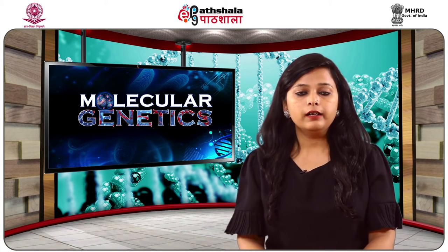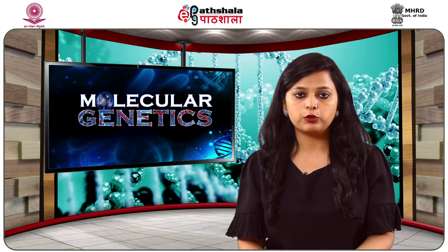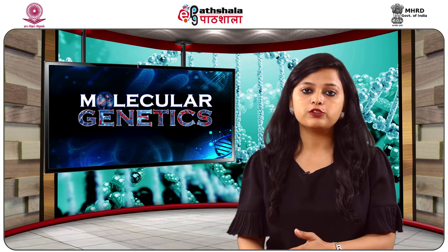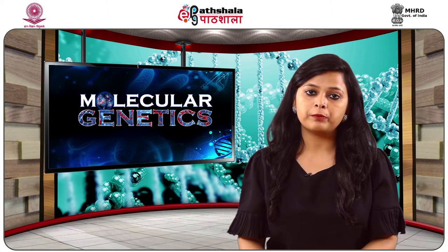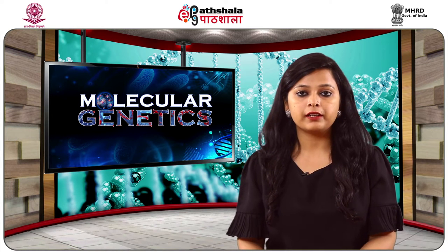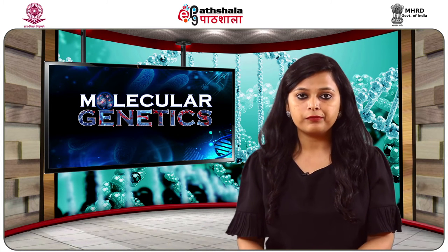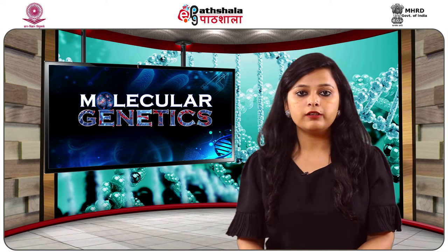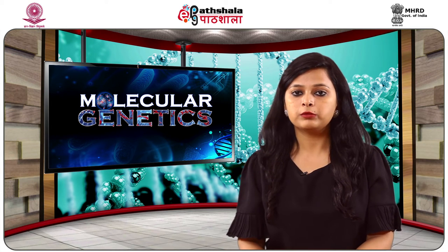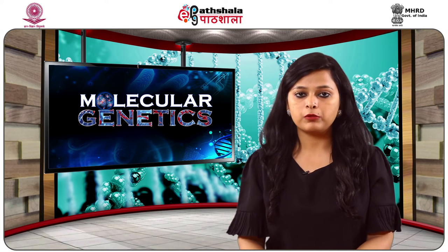So now let's talk about how we can do blotting and what the protocol is. The technique in which DNA, RNA or proteins are immobilized on a solid support like nylon or nitrocellulose membrane is known as blotting, depending on the type of sample, which could be DNA, RNA or proteins. Different blotting methods are available for different things. The technique is known as southern blot when DNA fragments are transferred, likewise for RNA it is known as northern blotting, and when proteins are immobilized it is known as western blotting.